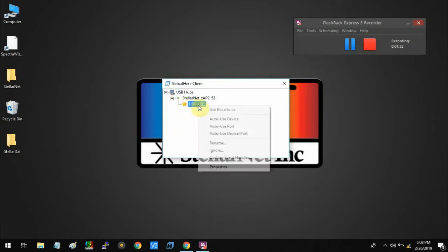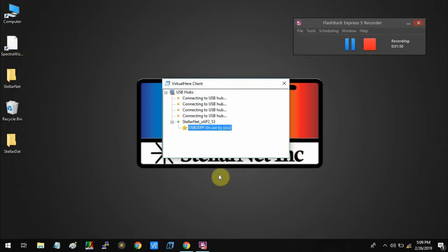And then I'm going to right-click on the device and say 'use this device' to connect it to the computer using Wi-Fi. As you can see, our spectrometer is now connected to the computer via Wi-Fi.